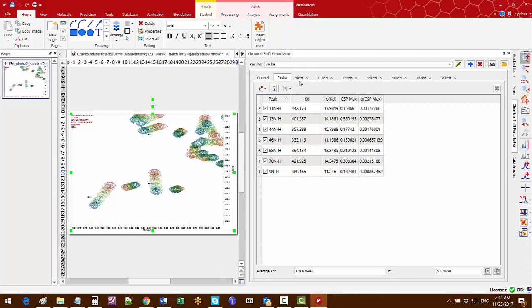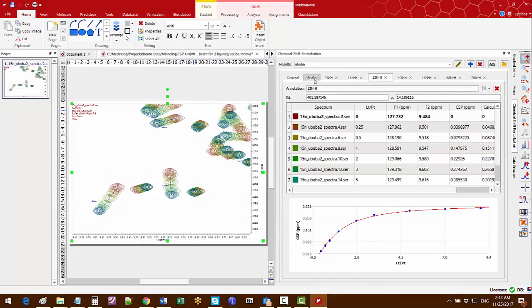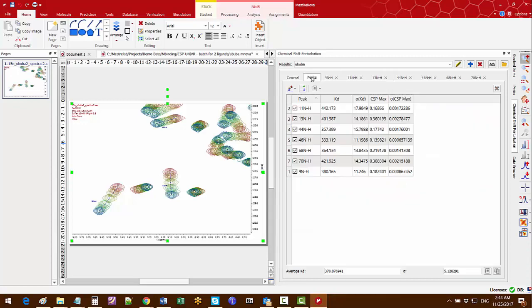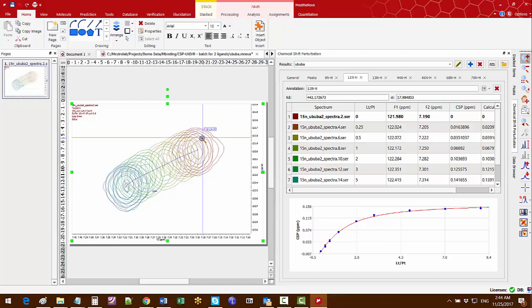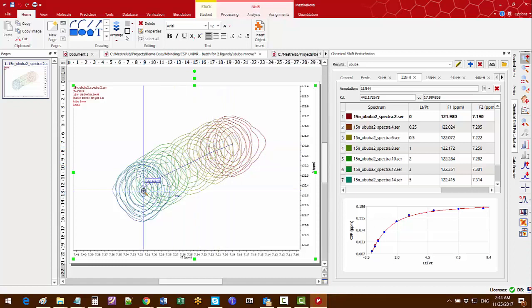In the individual peak tabs you can see the details of each test peak including the chemical shift changes in each dimension, the measured CSPs and the calculated CSPs from the fitting function. To see the details of a certain peak you can double-click on a row in the peaks tab and it will automatically zoom into that peak in the spectra and show the details in an individual peak tab.